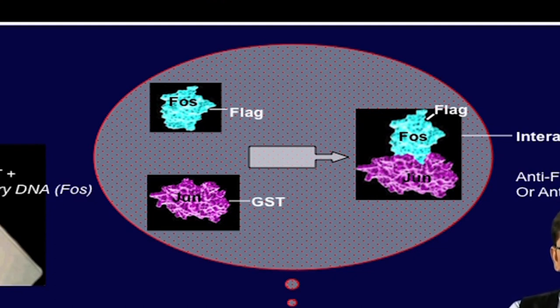Let us talk about co-expression. If you have protein microarrays, features are printed on the chip and you have generated the contents by using a cell-free expression system, and now you want to study the interaction, you need to purify a protein and use it as interactor. You can use protein specific antibody to identify the interaction, or you can use tag specific antibody for detecting the interactions. But in this study authors used co-expression. It means the query protein along with the arrayed proteins were expressed by using a cell-free expression system, so that there was no need to purify the query protein also.